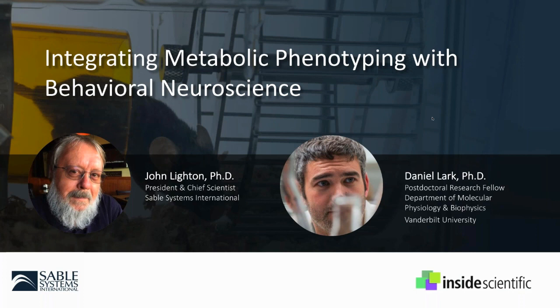First, we will be joined by Dr. John Lighton, President and Chief Scientist for Sable Systems International and the author of Measuring Metabolic Rates, a Manual for Scientists. Today, he will show how to properly plan and execute combination studies integrating high-resolution metabolic measurements and behavioral data. Dr. Lighton will continue with the important physiological-behavioral linkages that can be uncovered and qualified using the rich data streams from Sable Systems Promethion synchronized metabolic and behavioral system in conjunction with its Ethoscan behavioral analysis utility.